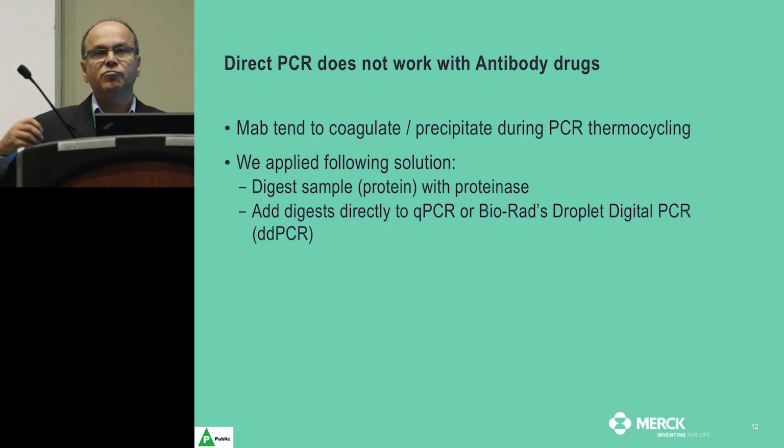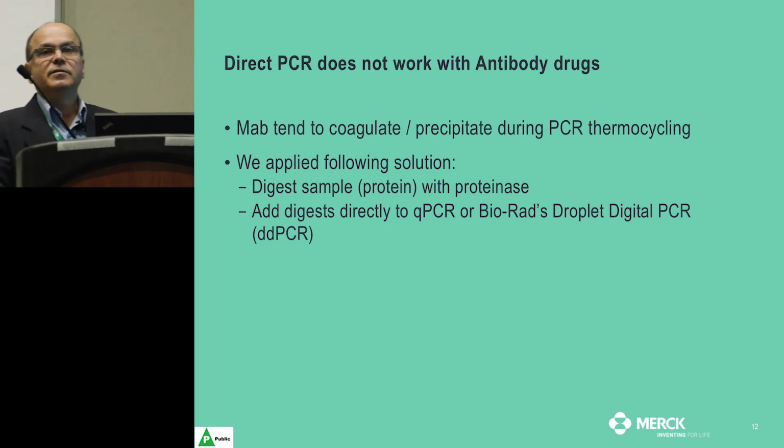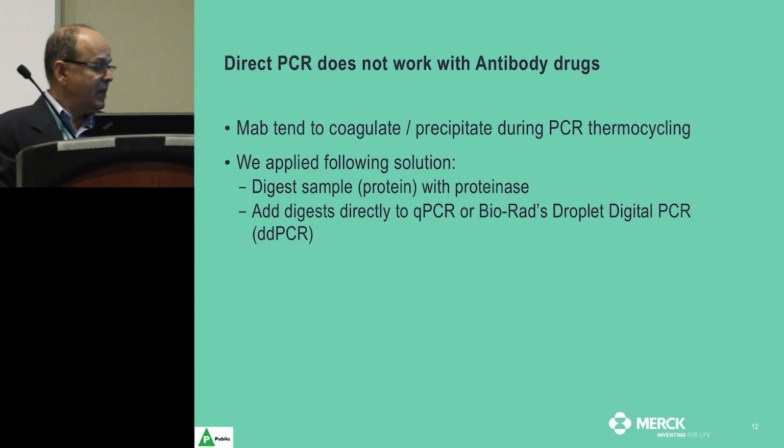There is a remnant, and that's enough to kill the DNA polymerase. This protease is operational at 60 C and can be denatured completely by incubating at 90 C for about 10 minutes. 5 minutes is also enough.